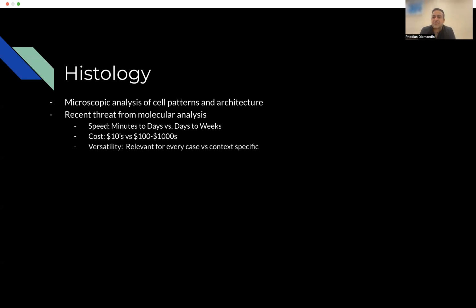The histomorphology is very versatile. It can work on, as we saw, infarctions, so you can detect chemical changes in oxygen levels. It works for infections. It works for tumors. It works for any number of different disease types, neurodegenerative conditions, whereas many molecular tests that we run today are highly specific for a specific use case.